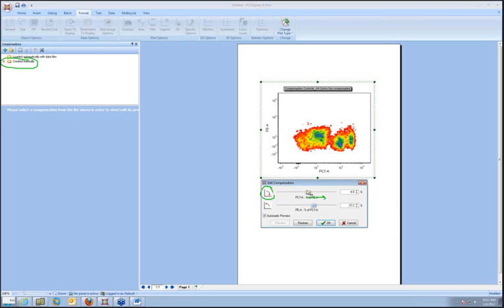If you don't want to see an automatic preview of your changes, you can turn off the automatic preview button. You can see now I'm moving the slider and nothing's happening, but when I press preview, it adjusts to the state that it's supposed to be. Most of the time, people leave automatic preview on so they can see what they're doing as they adjust the sliders.